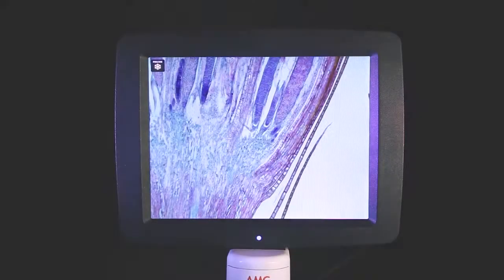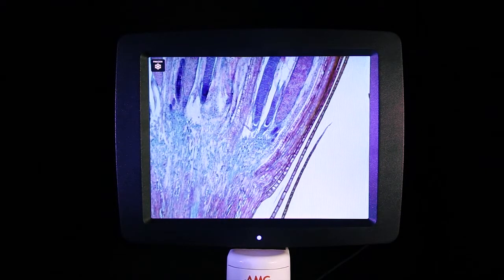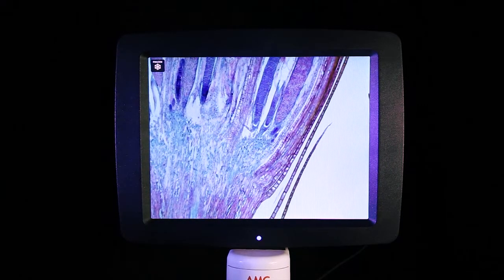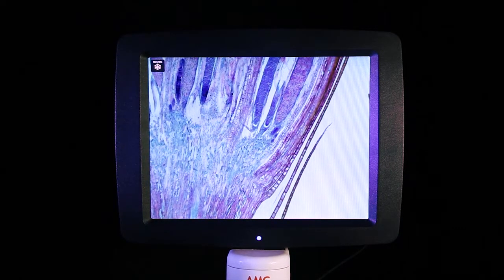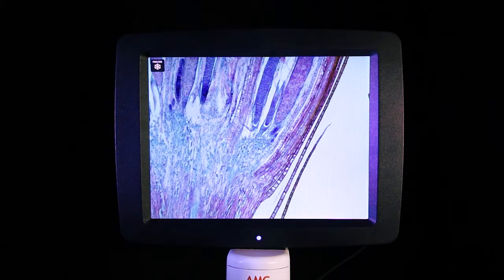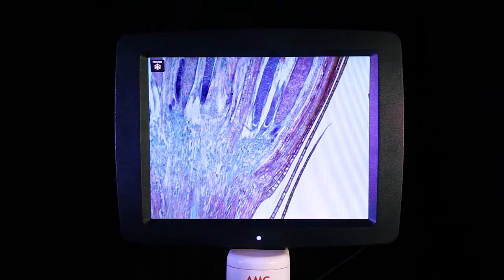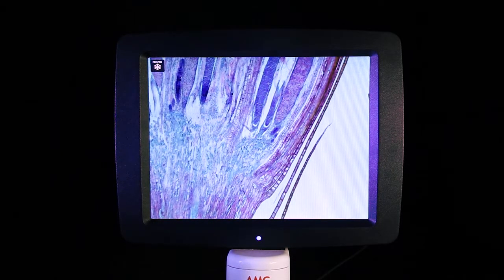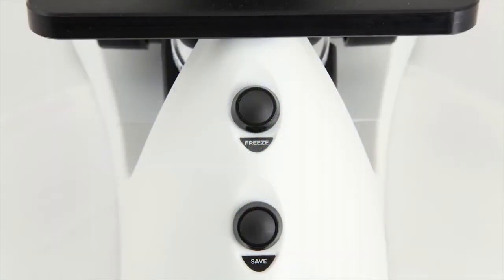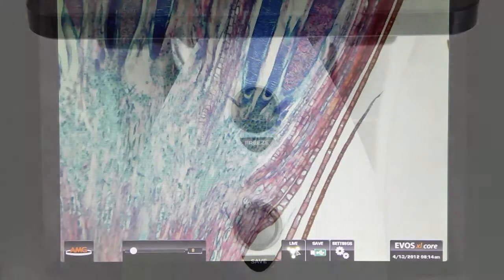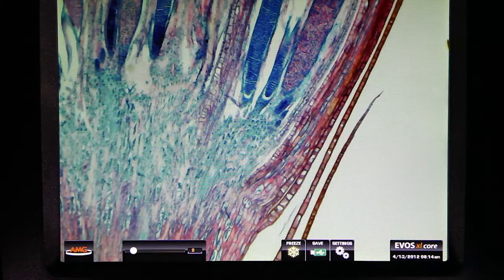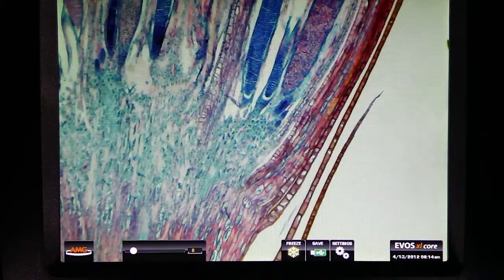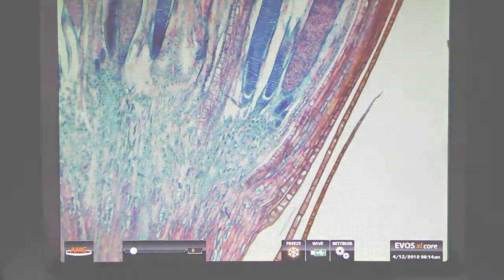Now that I've saved this image, I am able to move on to the next area of interest on my sample. To do this, all I have to do is toggle back and forth between the freeze and live modes, using the freeze button on the front of the scope or by selecting the freeze or live button on the LED screen.